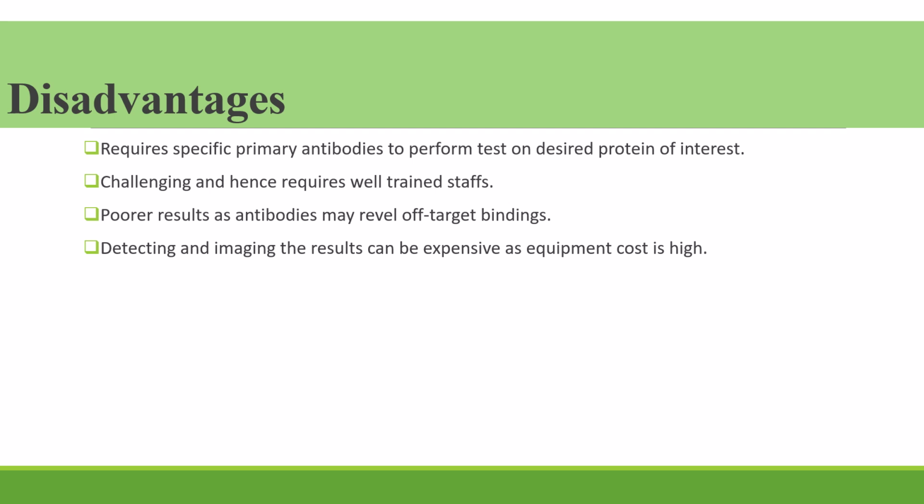It takes time, it takes patience. Suppose you fail, one experiment fails, the entire day is lost. It's not only a day. 12 hours of incubation, 4 hours, 2 hours, 4 hours of blocking, 2 hours of secondary antibody incubation, preparation of gel, and so many things. So it takes time, effort, and patience. So that is a portion, we can say, of the disadvantages. Multiple times you have to pipette. Trained staff should be there. Challenges in getting trained staff are also important.